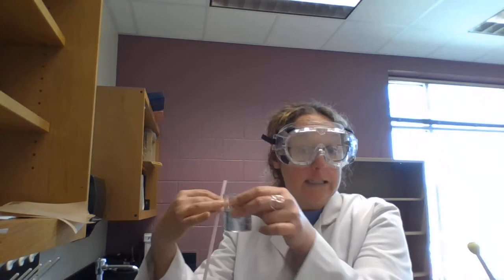All right, when we exhale, we release carbon dioxide. So carbon dioxide plus water should form what? An acid, carbonic acid. So if in fact I am forming an acid here, we're proving this type of synthesis, that a nonmetal oxide and water does form an acid. All right, so let me get going on this.